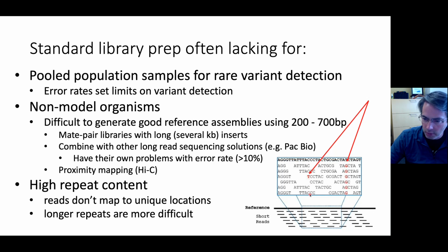Now, we don't have very many reads there, and that's an argument for needing greater read depth. If we had sequenced that position at 20-fold, so we would say this is 1, 2, 3, 4, 5, 6. This is 6x coverage of that site. This one only has 5x coverage.